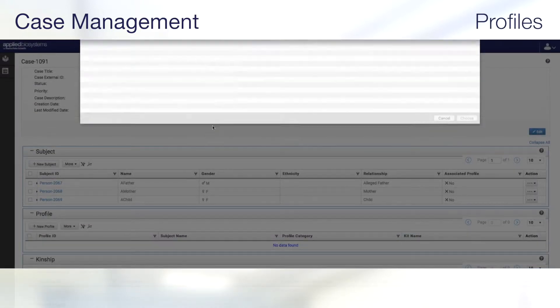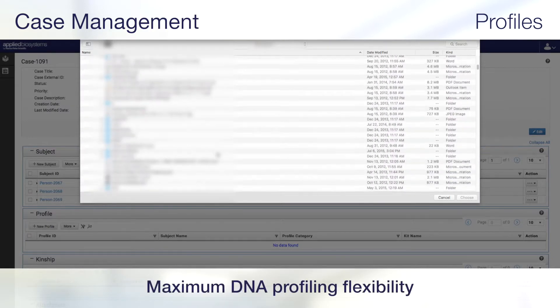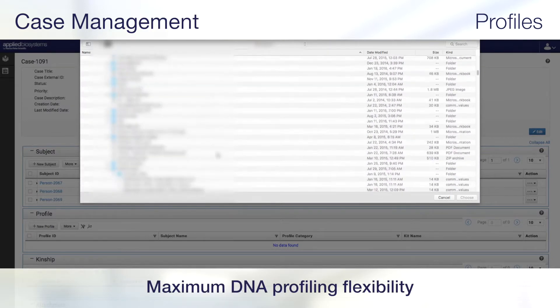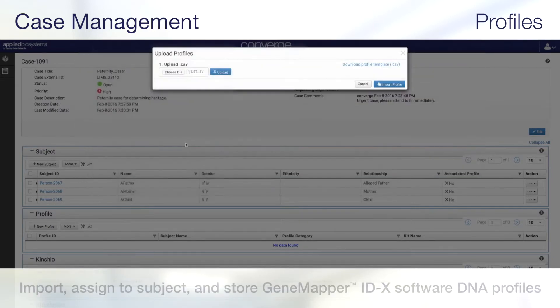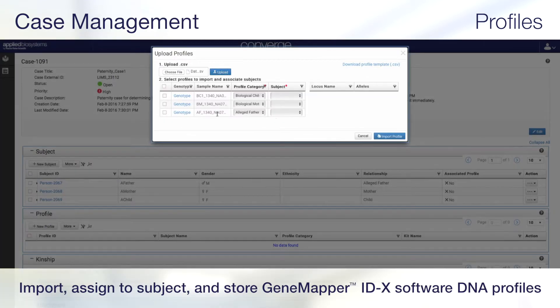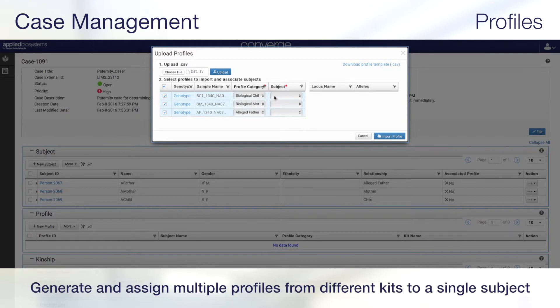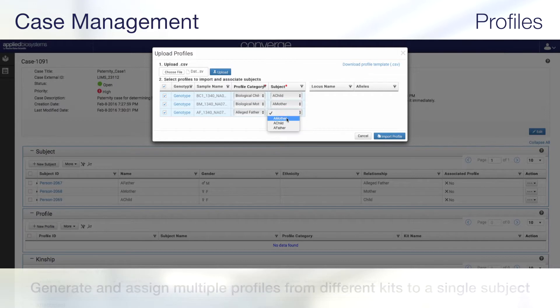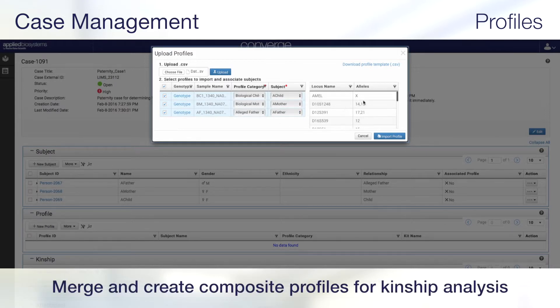Converge Software also enables maximum DNA profiling flexibility. DNA profiles from PrecisionID NGS Analysis or STR profiles from GeneMapper IDX software can be imported, assigned to subjects, and stored in Converge. Multiple profiles utilizing different chemistry kits can be generated and associated to the same subject.